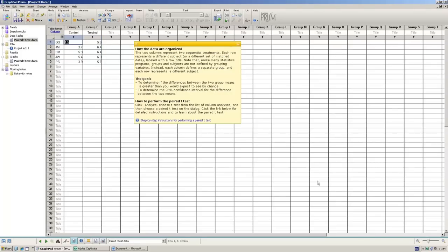Okay, so what you'll see is, as I said, it looks vaguely similar to Excel in this. You've got your spreadsheet layout, you've got your toolbar along the top. One thing we do have is this initial bar down the left hand side.